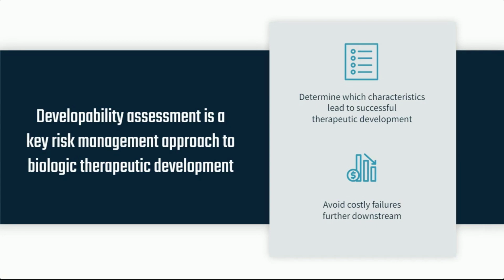Now, developability assessment can help mitigate the risk that is associated with selecting the wrong candidate or the wrong condition, which can save you not only time, but also money. If you're able to eliminate those bad candidates early in the process, that's much more preferable to investing your resources into something that's never actually going to make it to market.